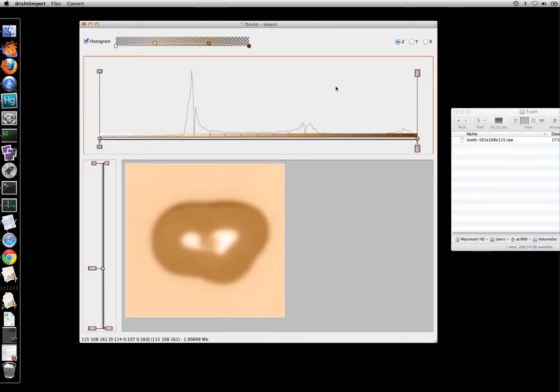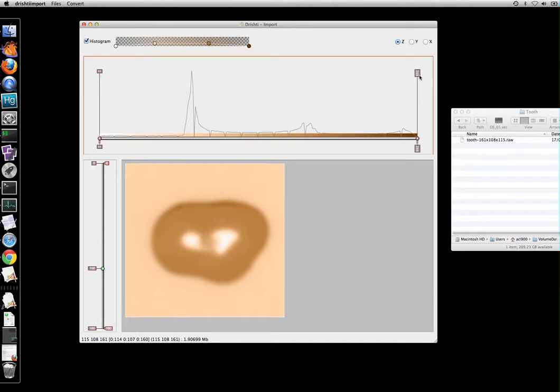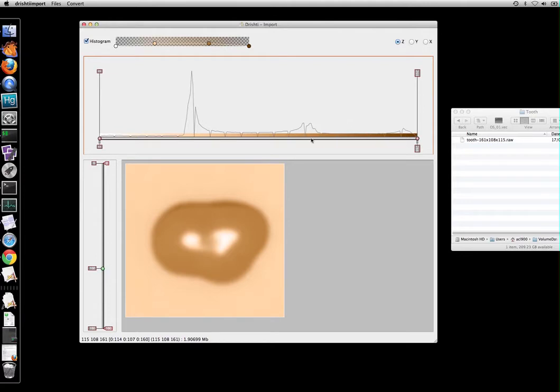These top values are the values in your data set raw values 0 and 255 and these are getting mapped to the byte. Now in this case our tooth data set is unsigned character or unsigned byte. Therefore we have the minimum and maximum values as 0 and 255. So we are just essentially taking the same data without any modification.